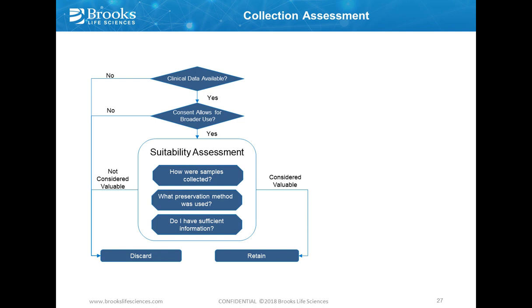So having collected samples, having them in a systematic way in a biorepository, in a biobank, of course, the collection will grow. It will grow over time more and more and more. And we should also have a strategy in place for how we assess this collection. What do we really need? Where do we have quite an overflow of samples? Can we use the samples to keep it really to the purpose of your collection? Also, your research strategy may change. And for that reason, it makes total sense to assess the collection. It may save you money in the end, and it helps you to keep an overview.